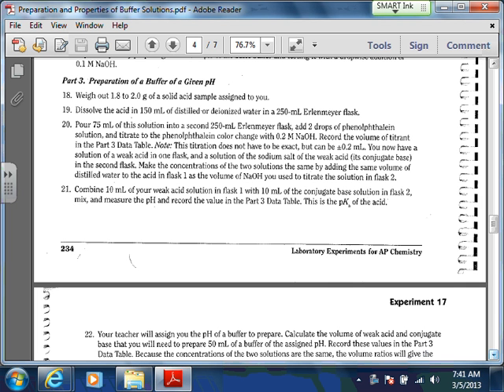that we did, where you were trying to find the Ka of a weak acid. You are basically taking part of that weak acid after you've prepared it, and this is going to be an unknown, okay? So you got to find the Ka of it first. That's the first thing that you have to do. So what you're going to do is basically make a buffer solution that is exactly equal in its concentration of acid and conjugate base, and when that happens, remember the pH is equal to the pKa. So then when you measure the pH of that solution, that's going to tell you the pKa of your acid, and then if you 10 to the minus that, that will tell you the Ka, all right, which will help you with some later calculations.